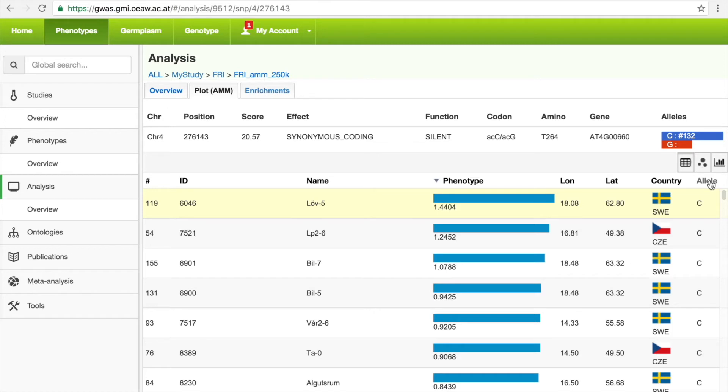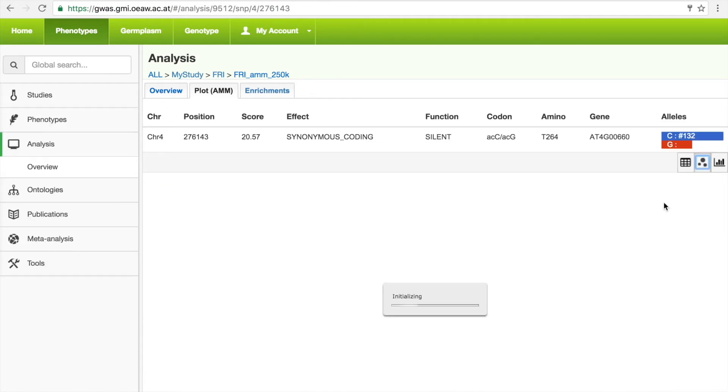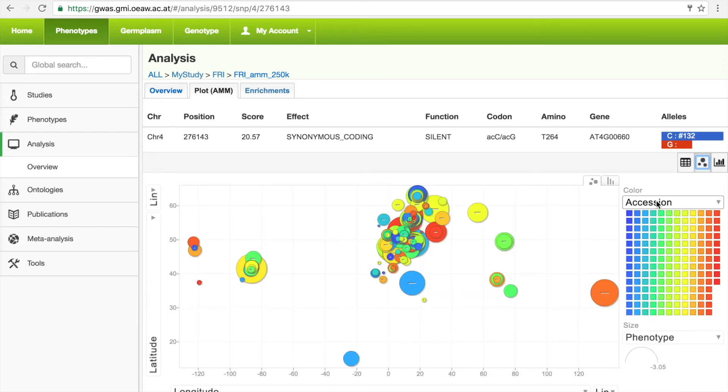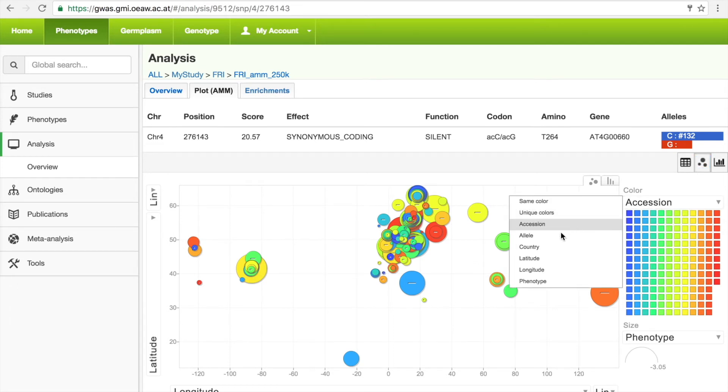The meta information stored in the portal can also help find interesting patterns in the data. We again display the motion chart, where each dot is an accession, and these dots can be color-coded based on their alleles.